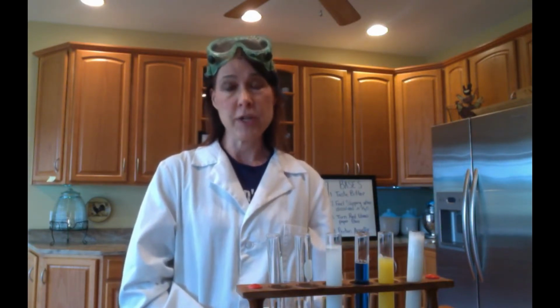Knowing the characteristics of acids and bases is important. So to help you learn them, we are going to perform the following lab together. I need you to have a sheet of paper and a pencil so that you can go ahead and write down our objective and what question we're trying to answer, what we're testing, and the results that we get.